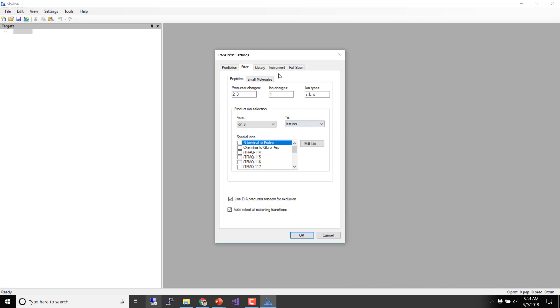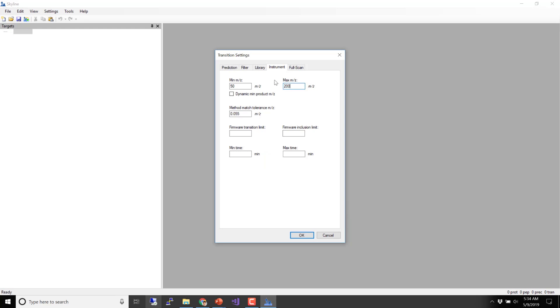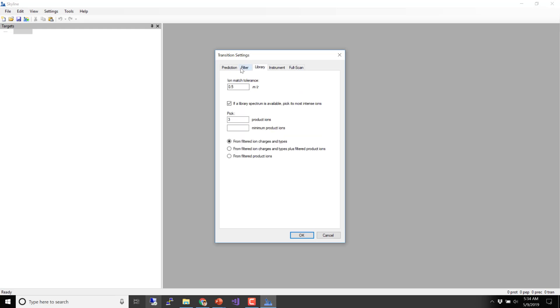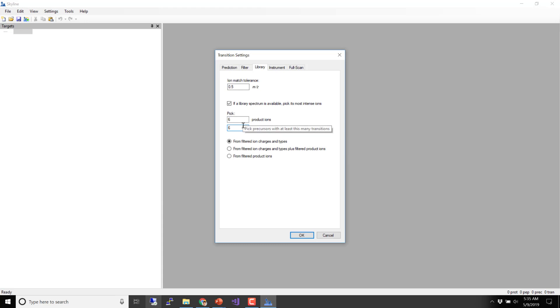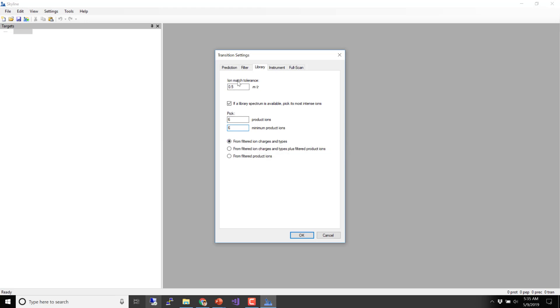On the Instrument tab, let's go from 50 to 2000 and say we want to pick six product ions. Why six? I tend to think we wouldn't really want to go much lower than four, maybe five. Six ends up being a pretty strong assertion. If you have a spectrum and you can't find six ions in it that match your peptide, how good do you feel about that? Saying six is kind of a fine assertion.